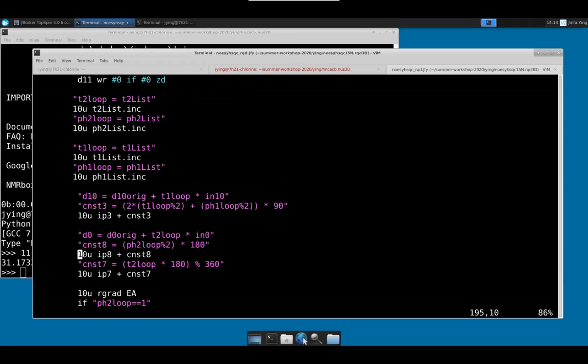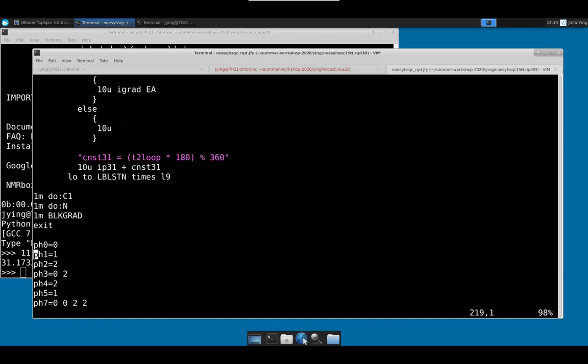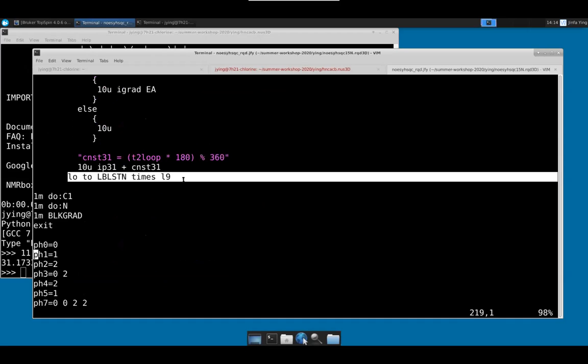And in the end, you do the same thing like you did before, again, followed by a loop like this. So it's a single loop for multi-dimensional, any dimensional, okay? Because the number of dimensions is really handled by the sampling schedule.